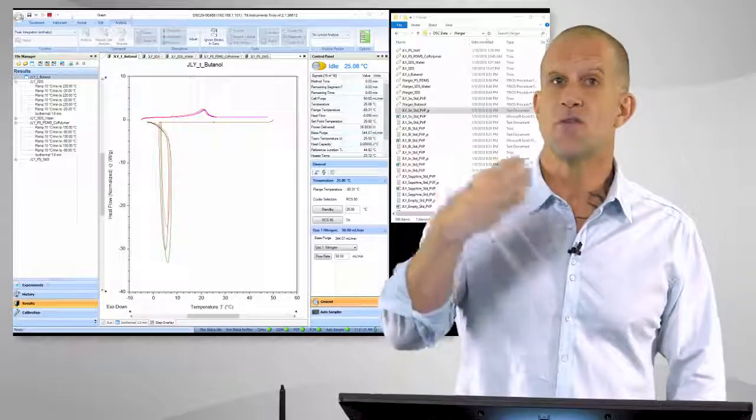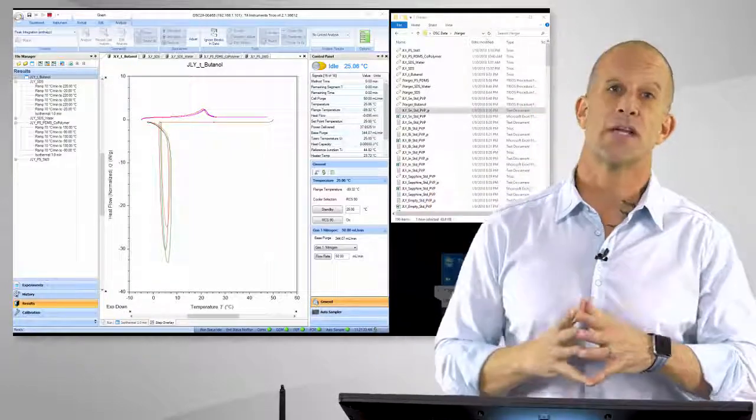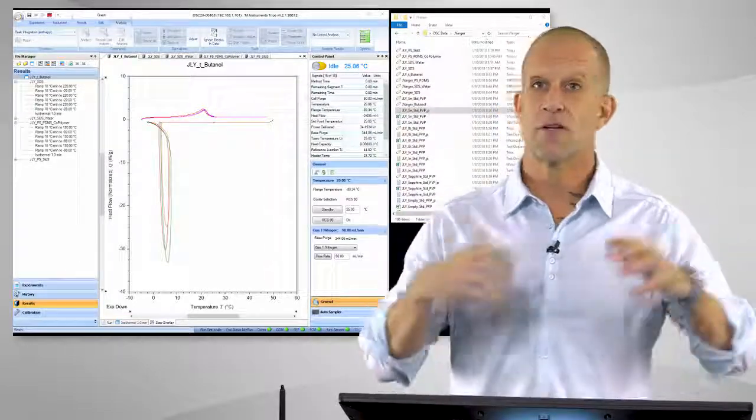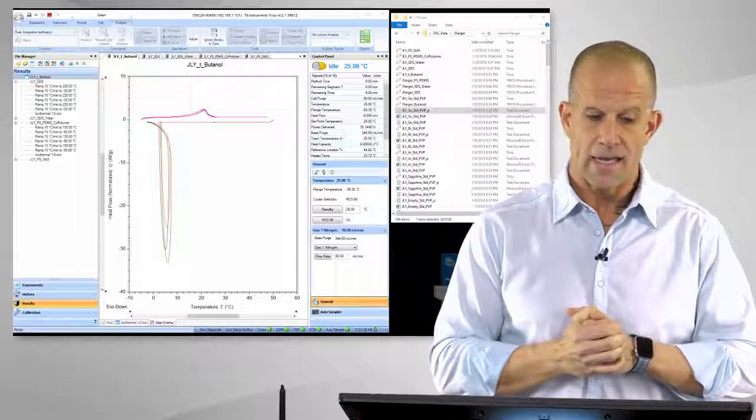You can go to their website and download it for free. They provide the software to anyone. So once you have the data, you can download their software to do any type of analysis on it directly.